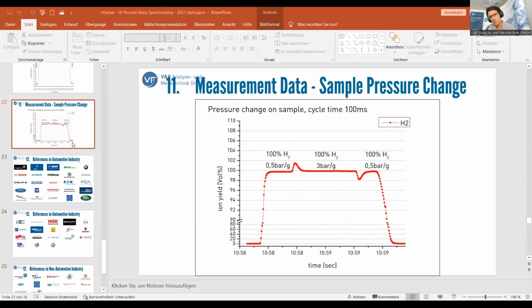If you have multiple sample locations, there are typically rotary valves with 16 ports where you can supply gas and then switch between the different locations. In principle, you can always measure only one location at a time, but you can switch between locations using a sample switching system.